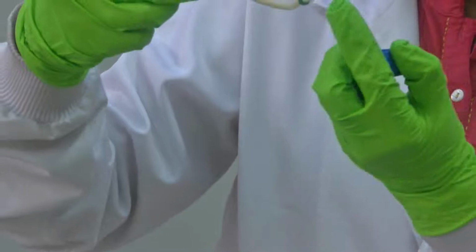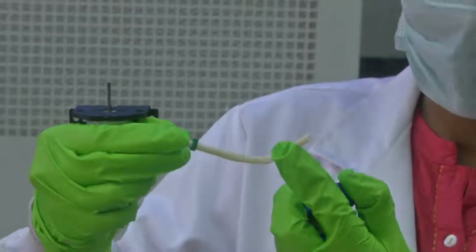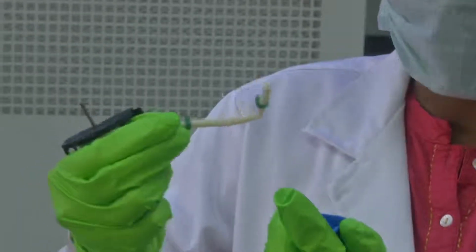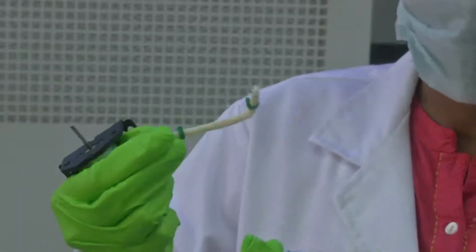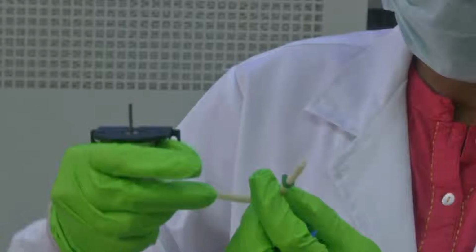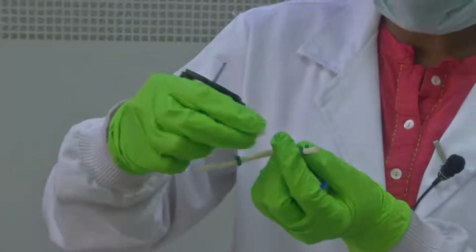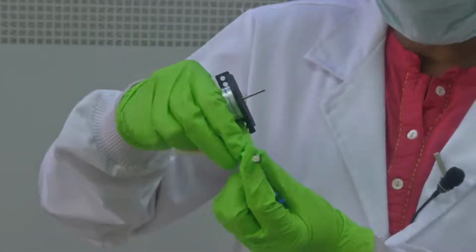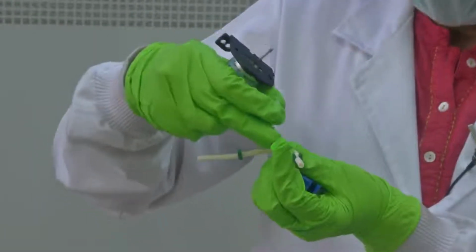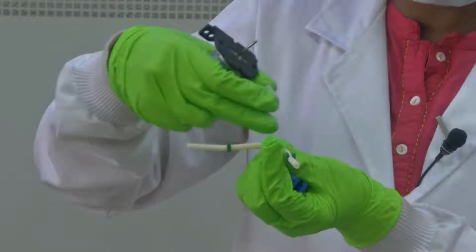As you could see, it's a relatively larger diameter than what we use for our biochip or microfluidic devices. This cannot be used, but this is just a demonstration of how a peristaltic pump looks and what goes into the pump. This is the tube through which fluid flows, and while your motor drives, each of these rollers would compress the tube. There is this compression, this pulsation, and as it releases, you see there is an increase in volume, and then the fluid tends to move forward.